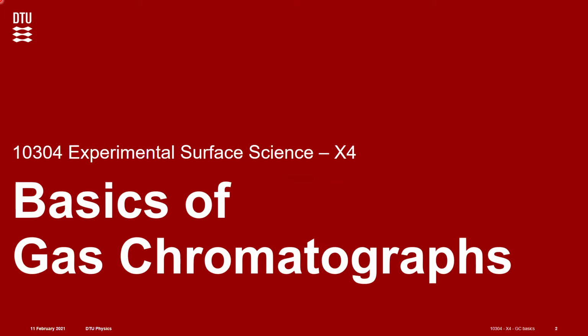Welcome to this short video on basics of gas chromatographs. Gas chromatography is a very important tool in CO2 reduction because we can have multiple different products and we need to be able to quantify how much we get of the different products. In this video we will look at the more technical part of how the gas chromatograph works and how we analyze the data, what the data means.